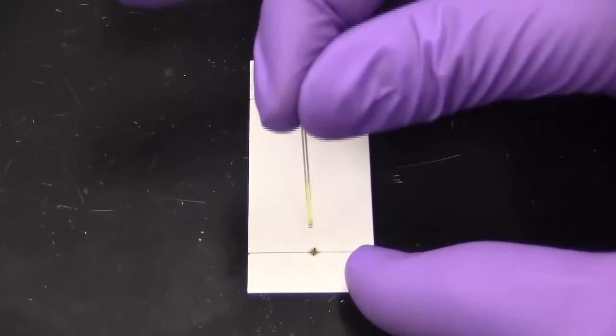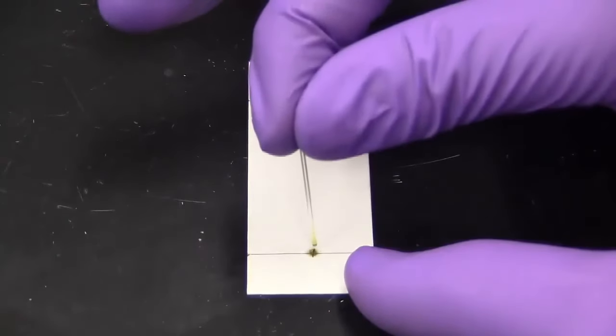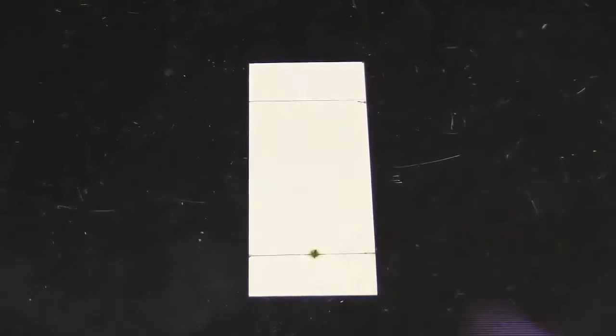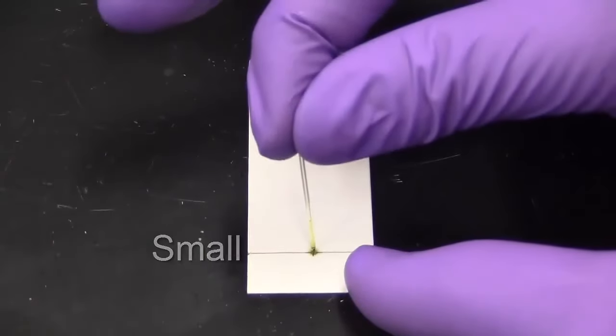Press the tip of the tube briefly to the TLC plate on the tick mark at the start line. Repeat this process until you have a concentrated point of sample. Keep the sample spot as small as possible in order to maximize your resolution.